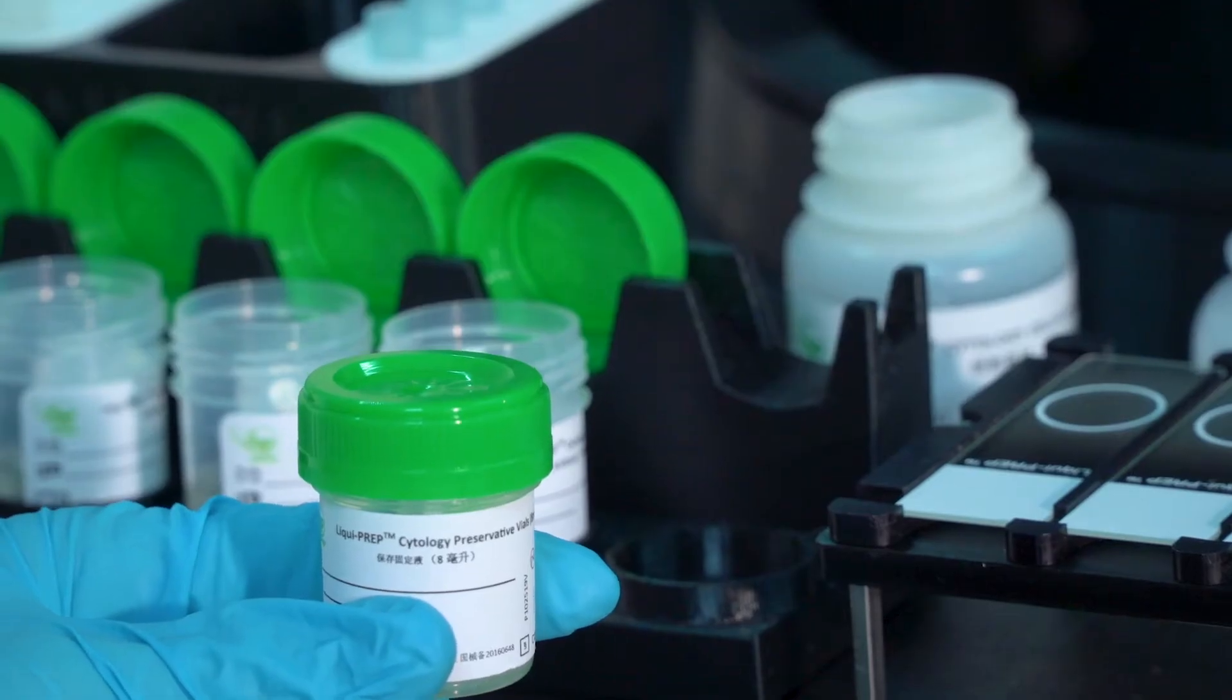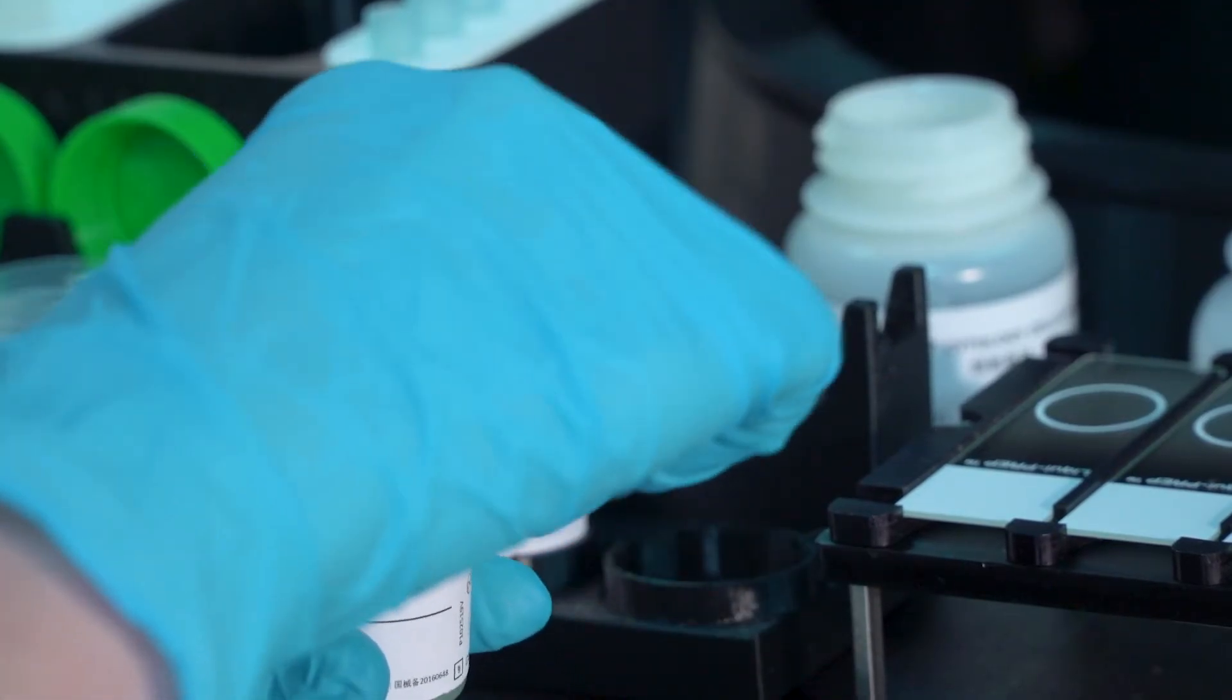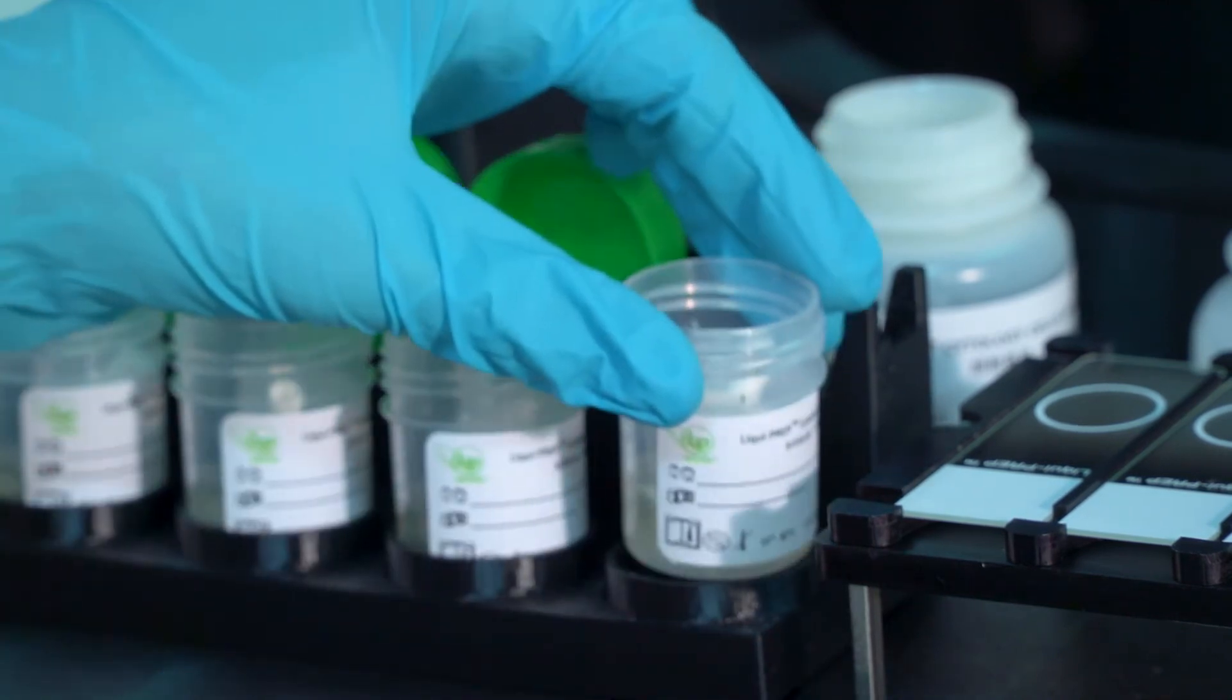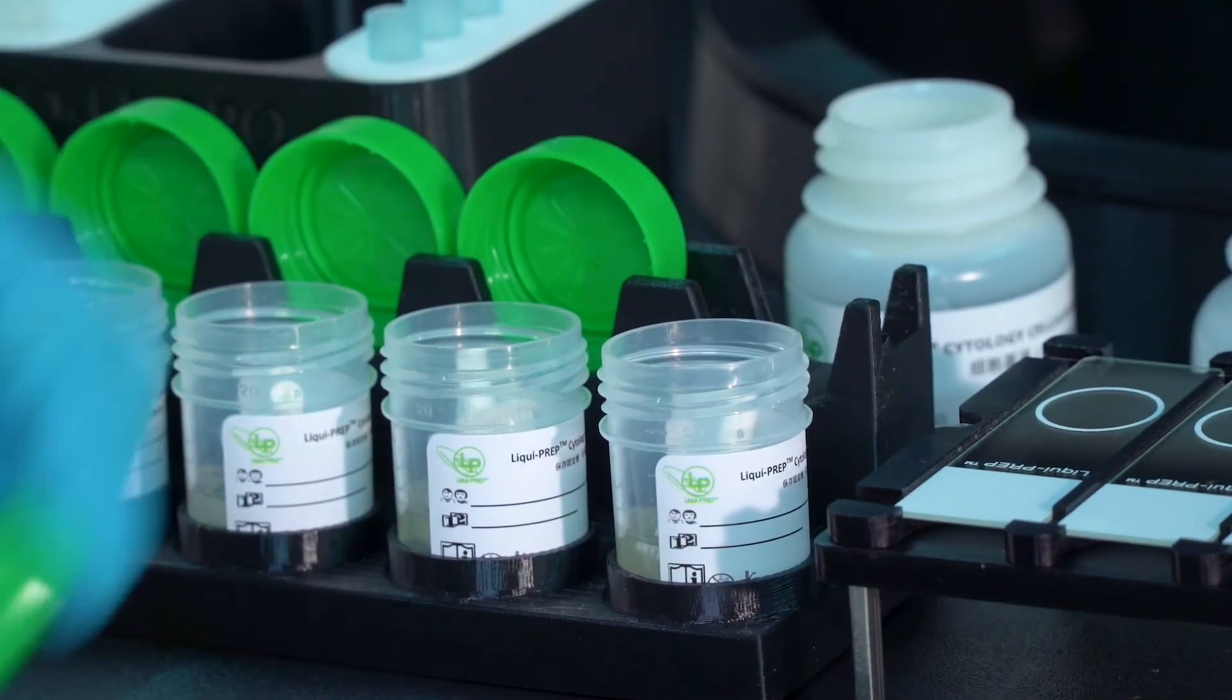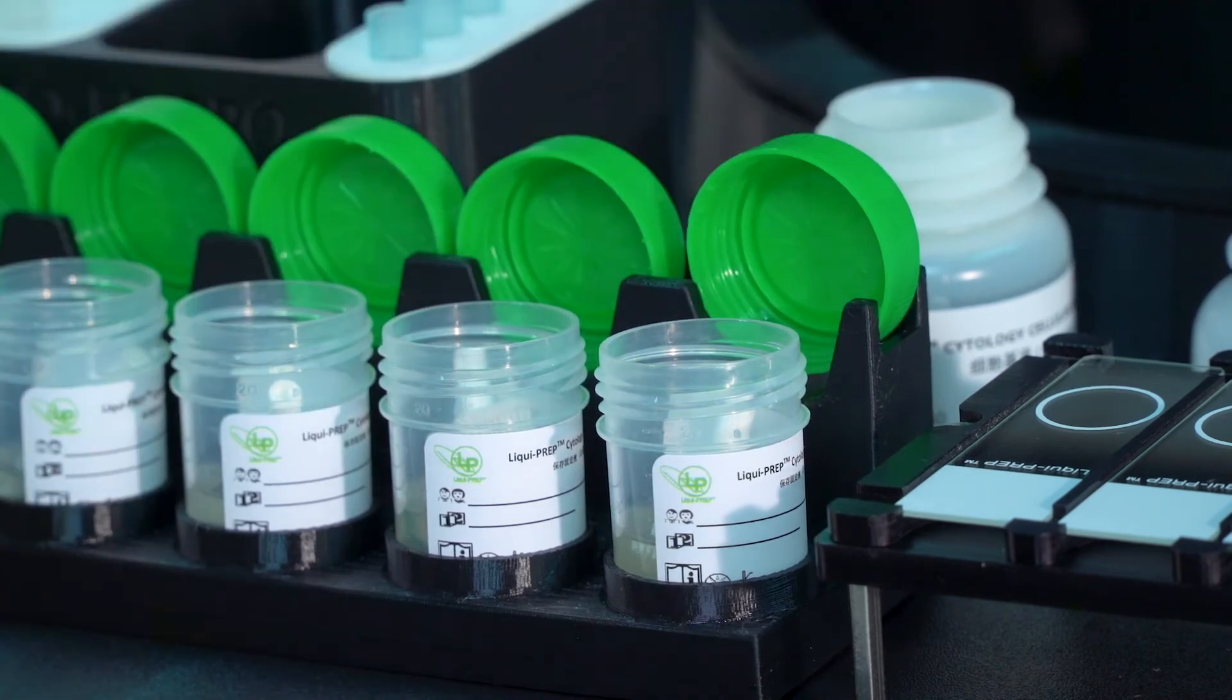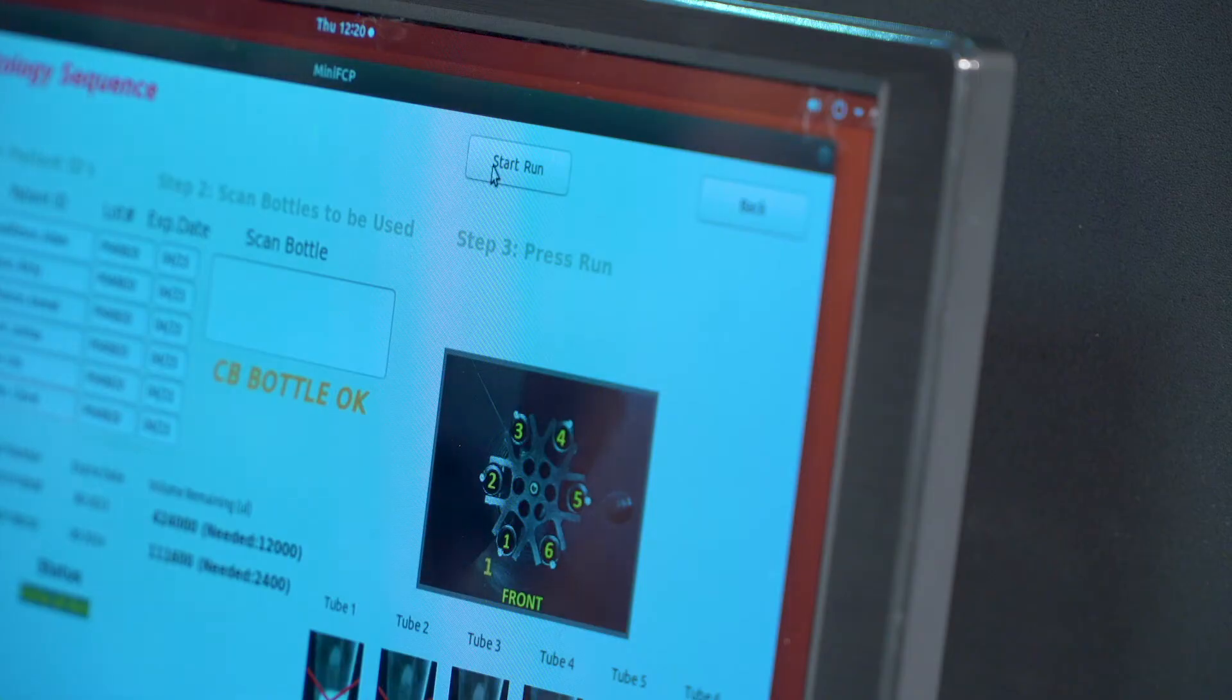Remove the specimen preservative vial lid, then place the open vial onto the AutoLP Pro specimen processing rack. The vial lid can be placed in the slot behind the corresponding vial. Press the run button.